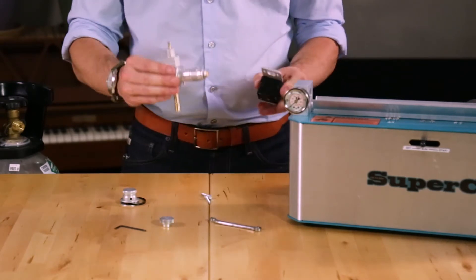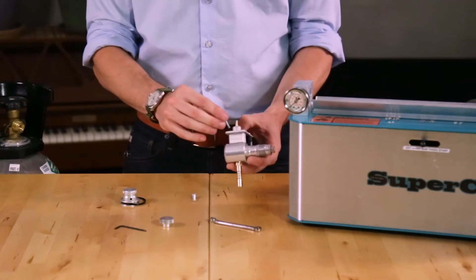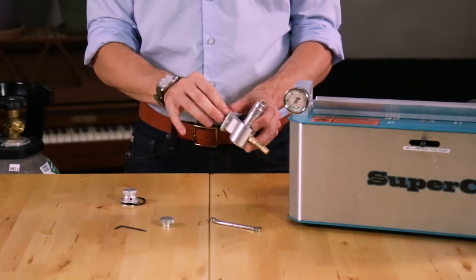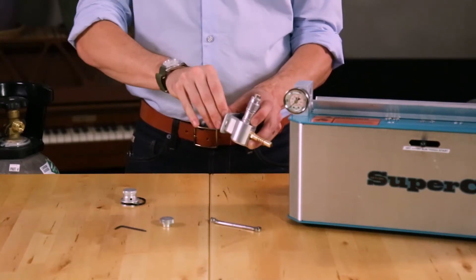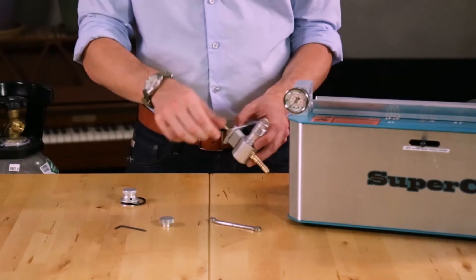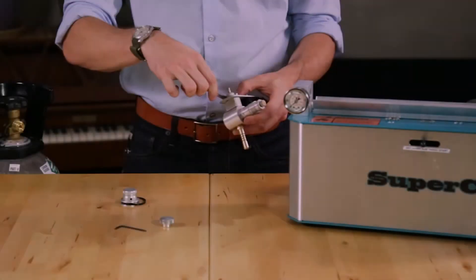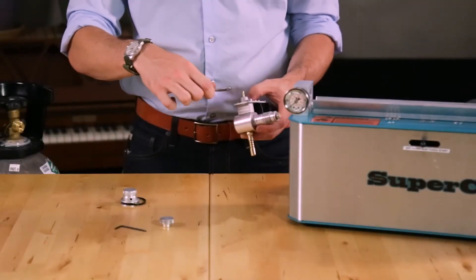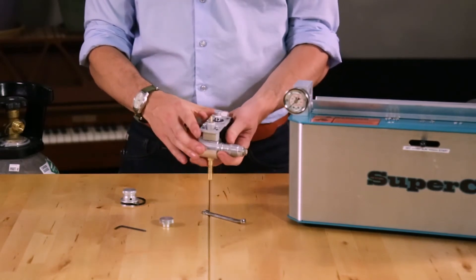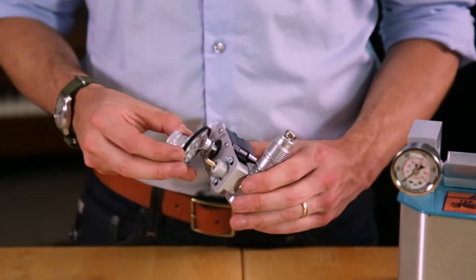With the stepper motor and the valve oriented like this, you can take the bolts and replace them to capture the motor. At this point, we don't want to tighten the bolts too much as we'll need the slack to tension the belt. With the mounting bolts most of the way snug and the plate pushed all the way forward, you can now mount the new knob and the drive belt.